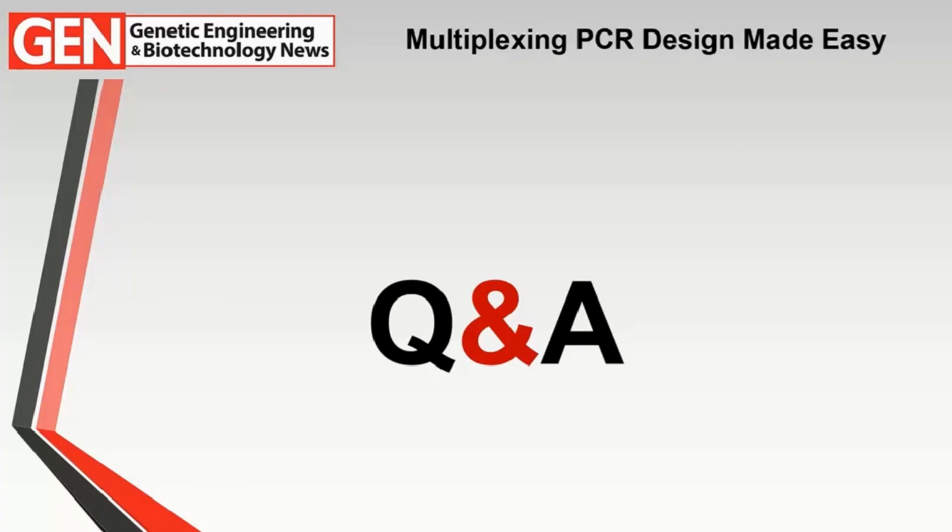Depends how big your plex is, and it depends how big your inclusivity and exclusivity and background panels are. So a typical case, like I mentioned the Zika virus during my talk with 168 targets, and the exclusivity had 5,000 different viruses, and then we had the human genome in the background. That panel took around 8 hours to run using our 36 CPUs dedicated to their job.